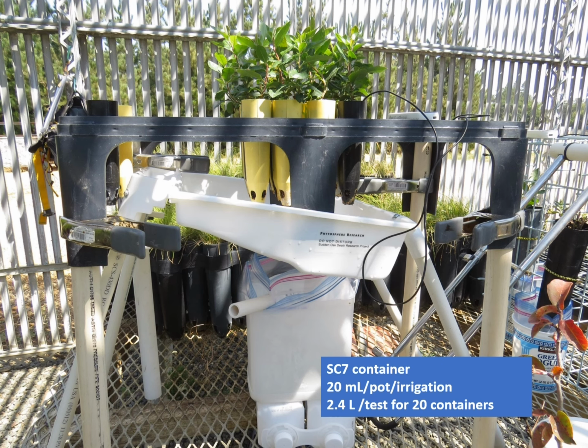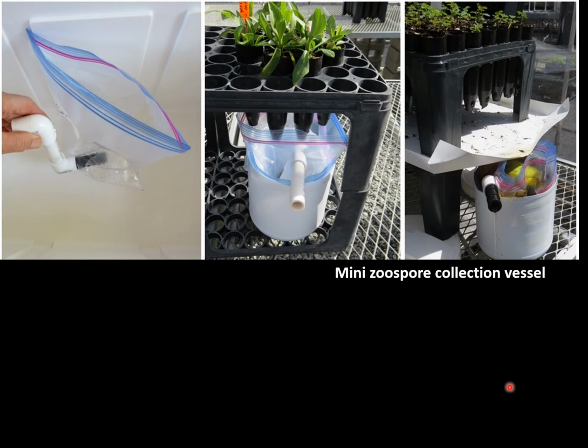We've also done, in our various studies, small scale things where we're looking at other questions, but in this series of SC7 containers, we have 20 in this container. They only get 20 mils per pot, so we're only talking about 2.4 liters for the whole irrigation. You'll see here we're using a small scale version of the zoospore collection vessel.